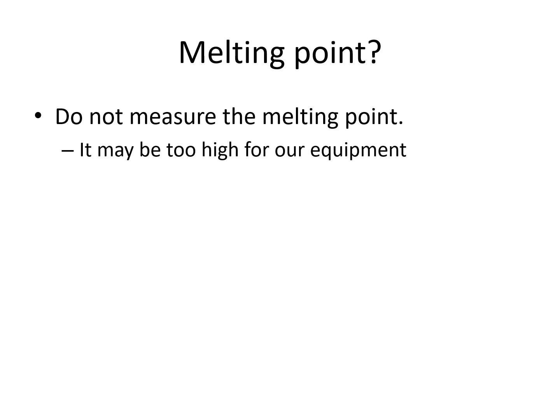It's more than 230. So that might not be suitable to do with the melting point equipment we have in the lab. So we can keep this aside.